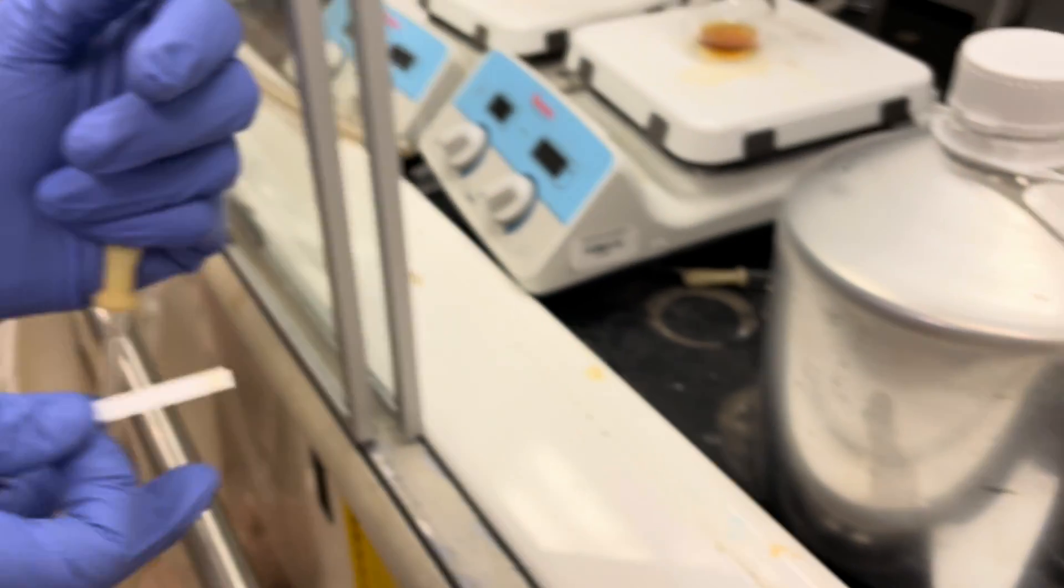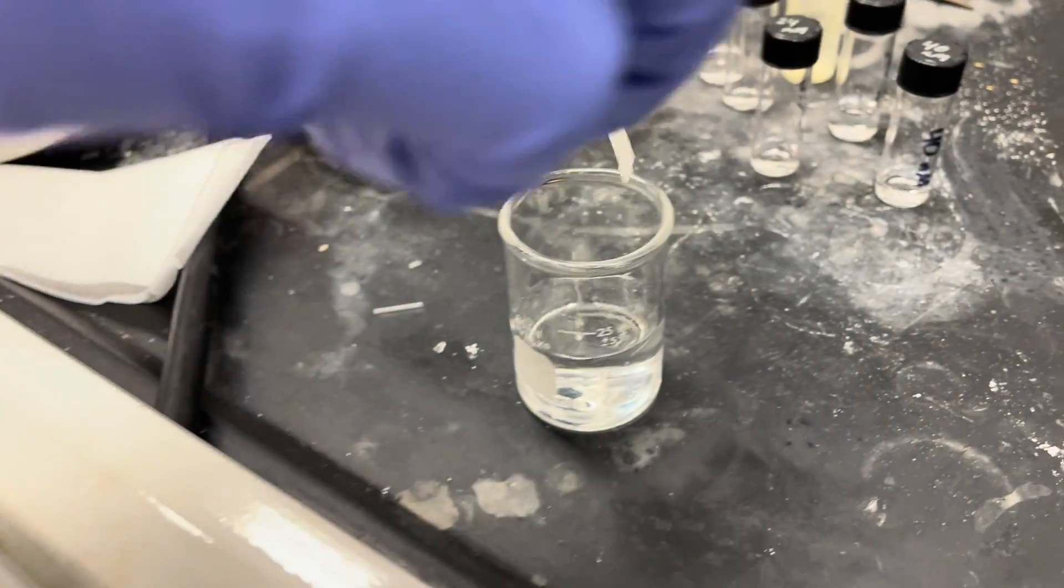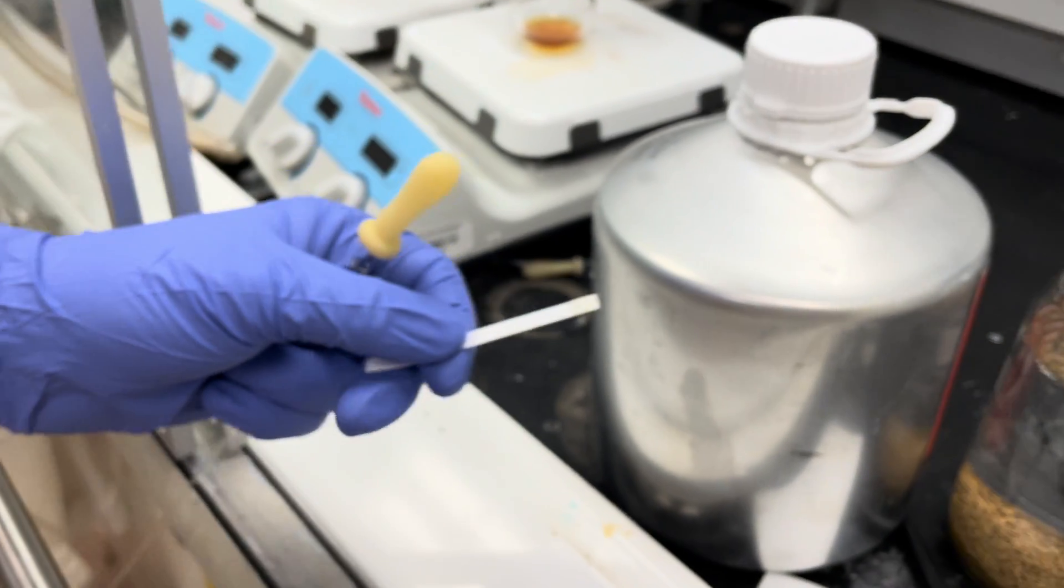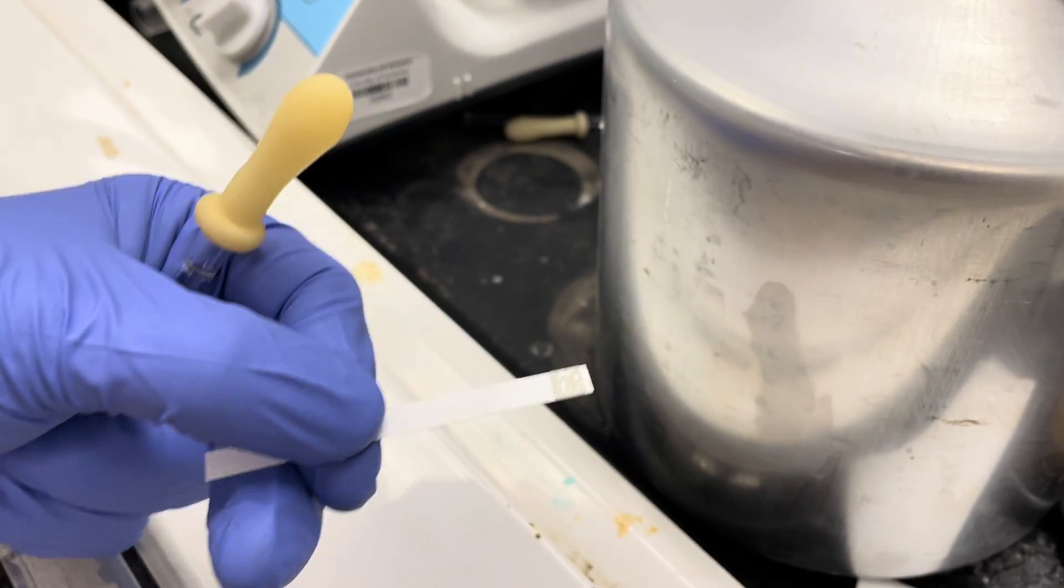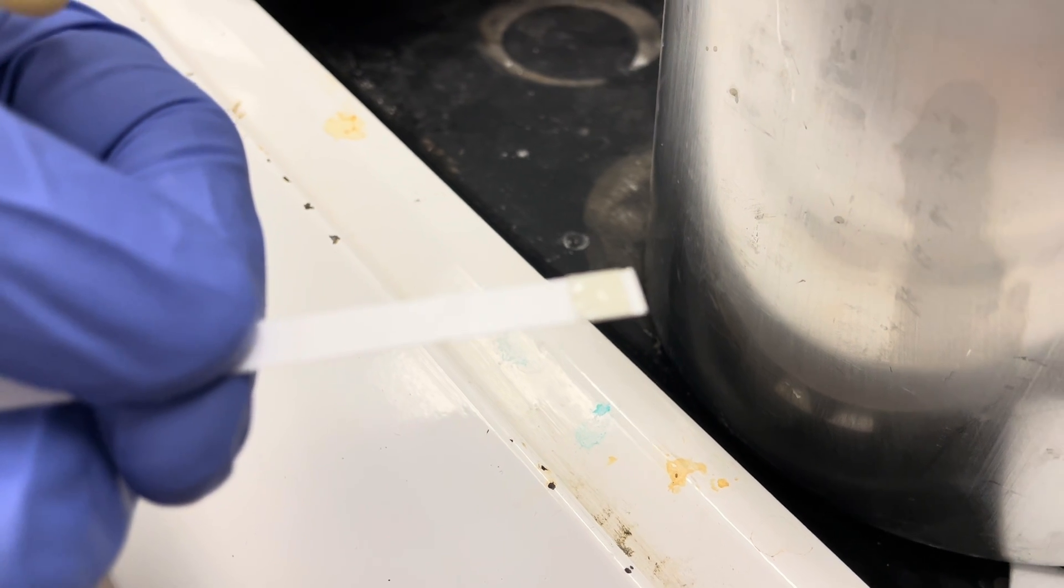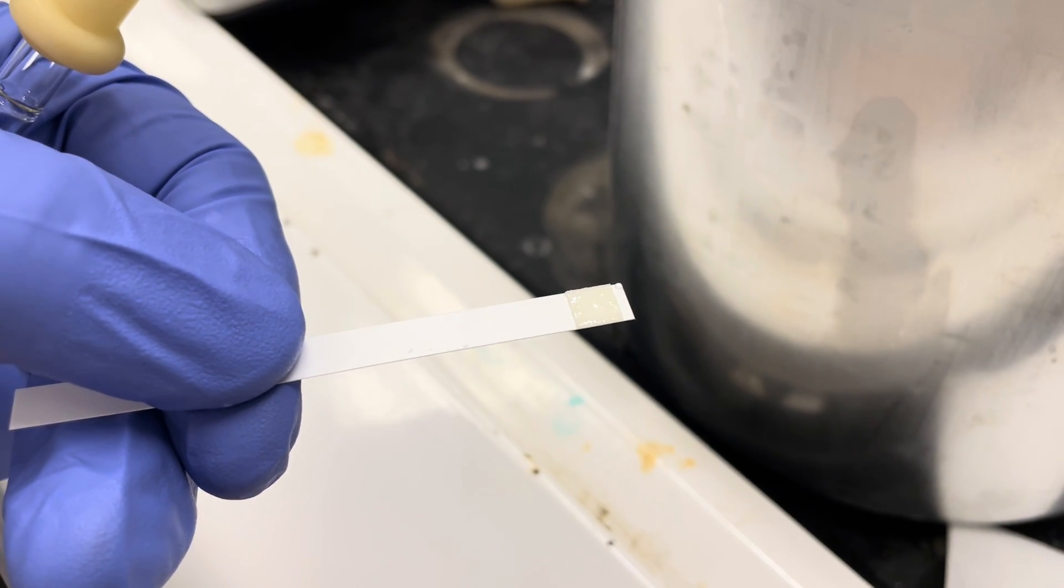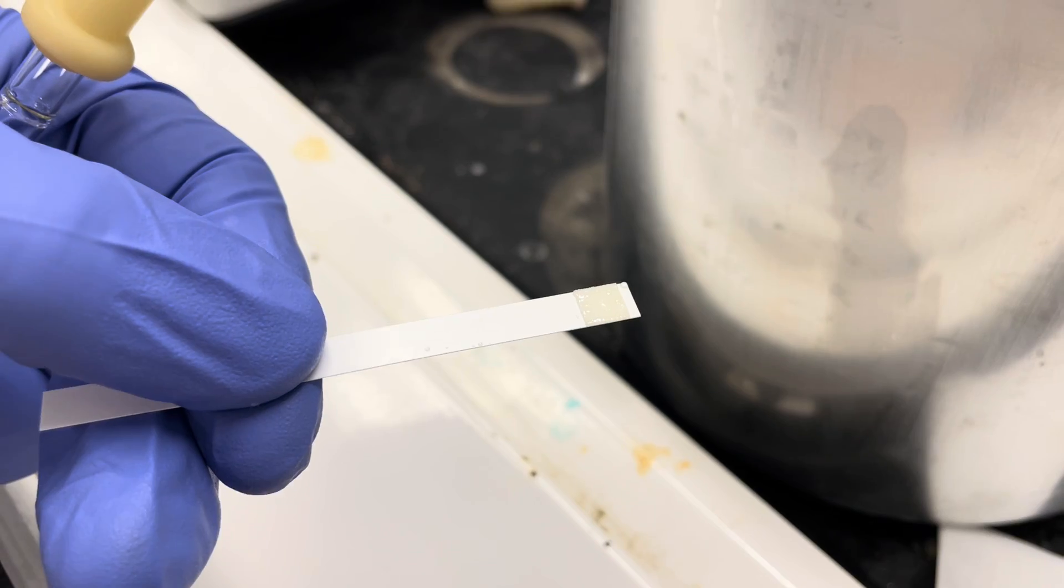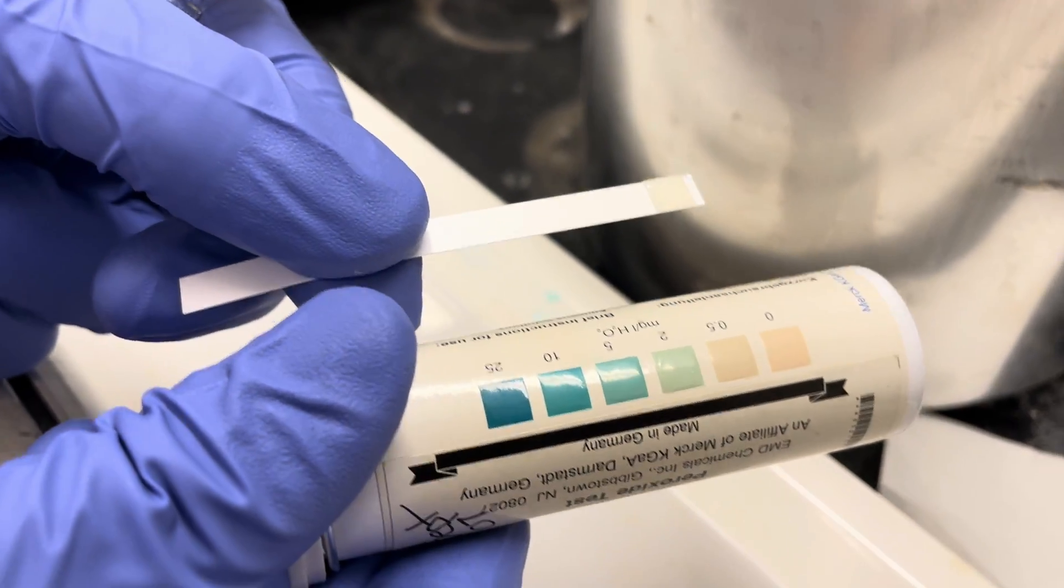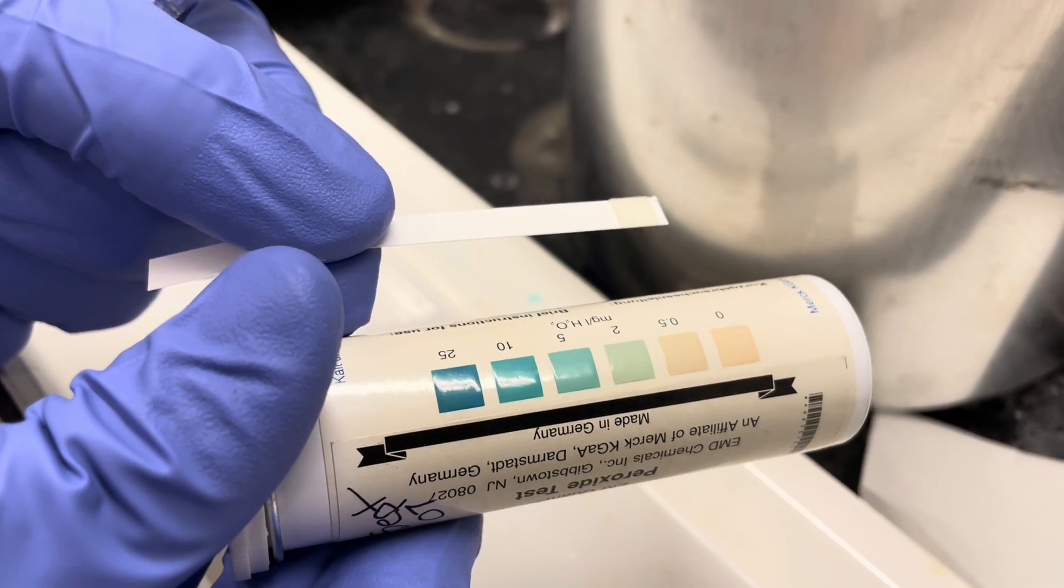Once it's evaporated, it needs to be dipped in water and then read after 15 seconds. This is just some deionized water here. So after 15 seconds you can see this diethyl ether does not have any peroxides in it.